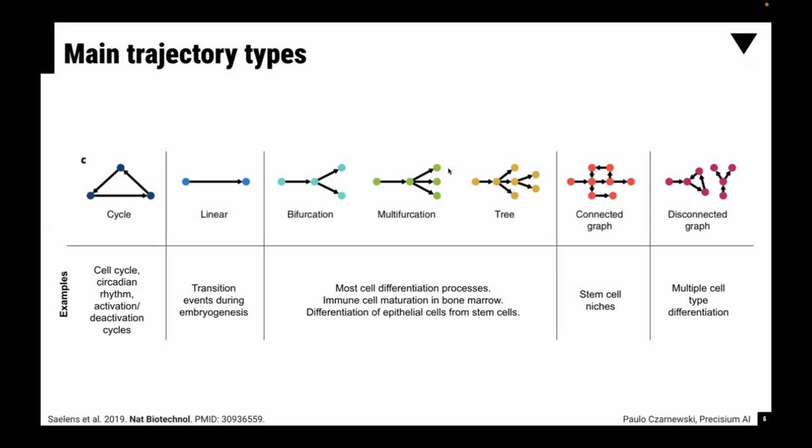So sometimes it is easier also to do trajectory analysis on parts of the biology. So for example, I want to study only the enteroendocrine cells. So you can actually just try to focus on that one instead of taking all cells in your data set into consideration.